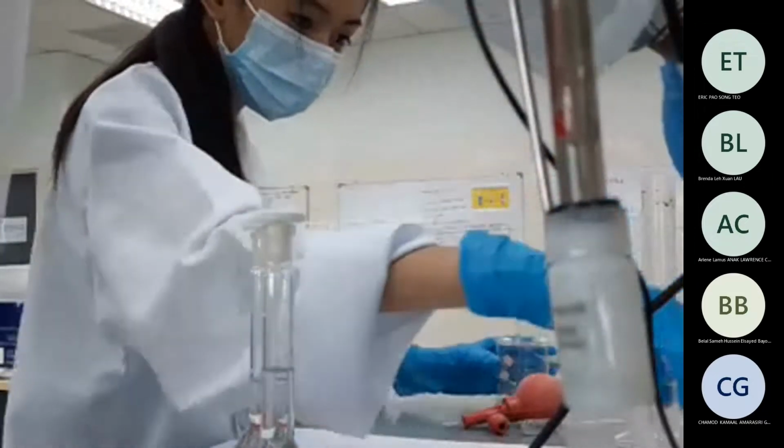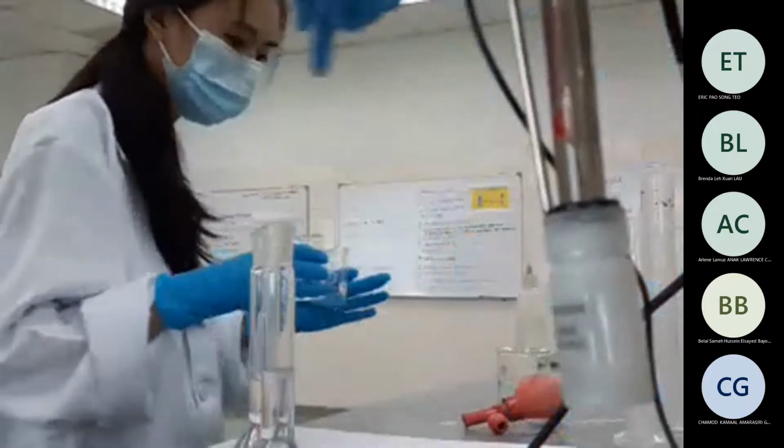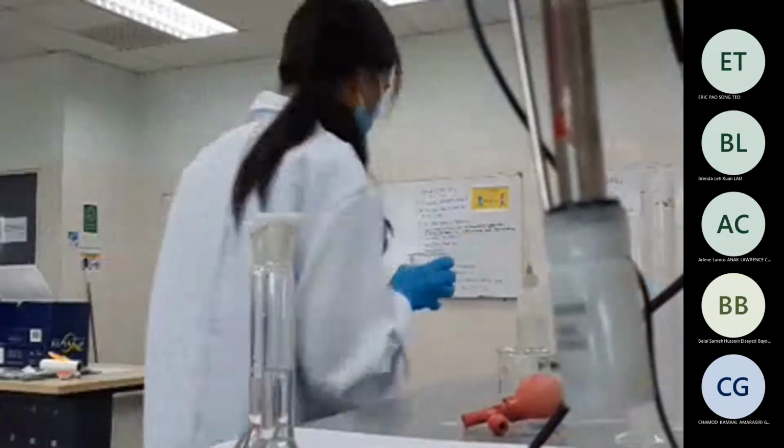These two, you don't need them anymore. So what you do is just discard this in that waste bottle, and then wash it with the tap water, then rinse it with the distilled water. Go do it faster.